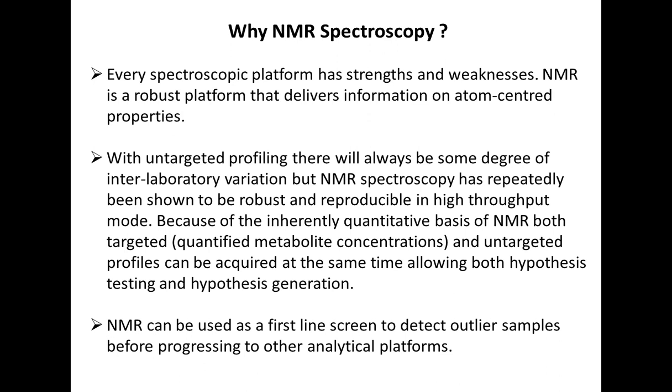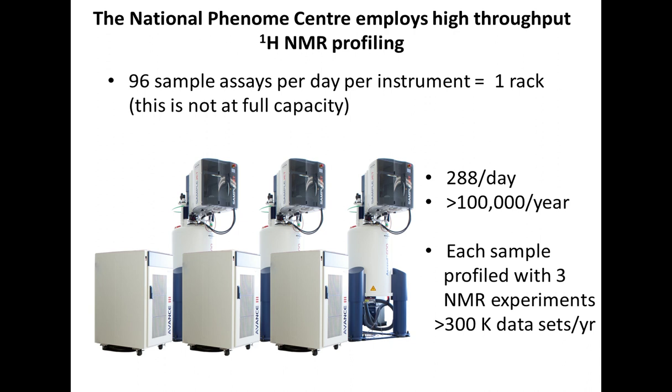So we use it as an entity in its own right to deliver scientific information, but we also use it as a first-line screening tool, and that is very important to us because it enables us to get through tens of thousands of samples a year.